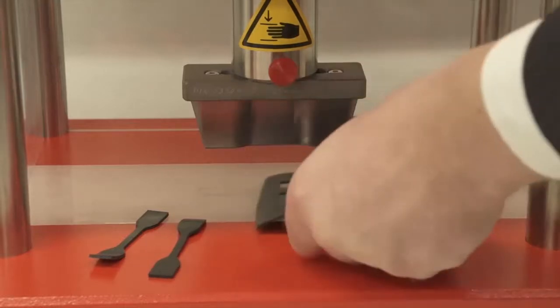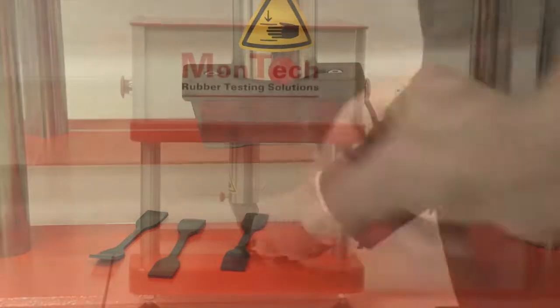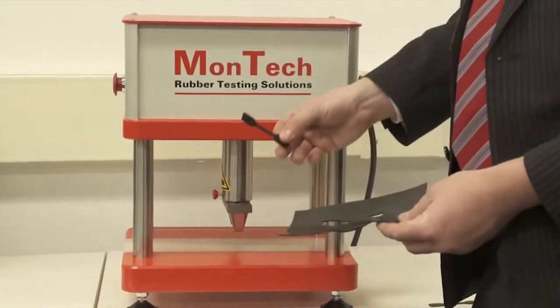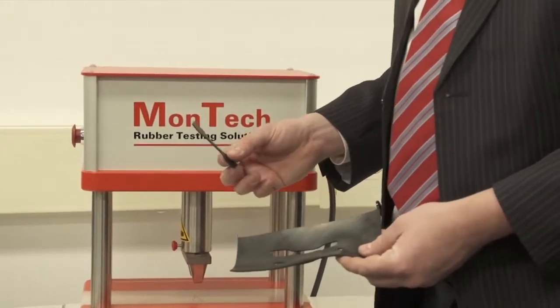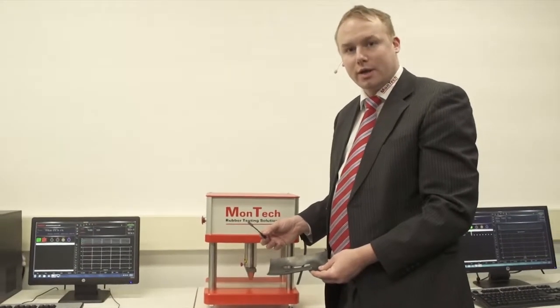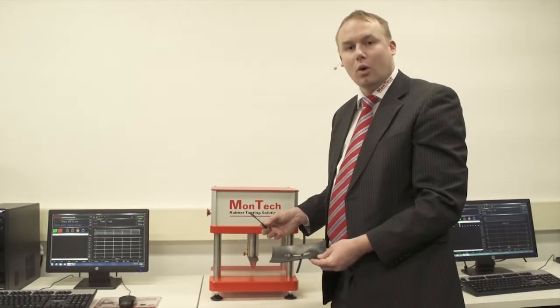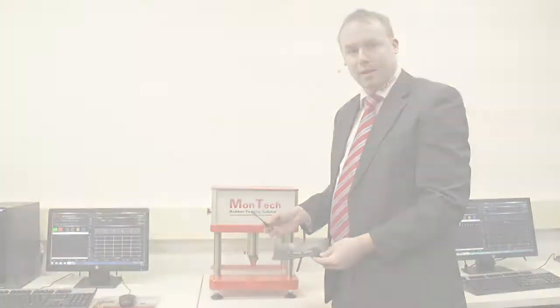Repeat if you want to cut another sample. Besides the sample cutters, Montec also offers a full range of cutting knives with spring-loaded ejector according to any international standard or customer requirement. Thank you.